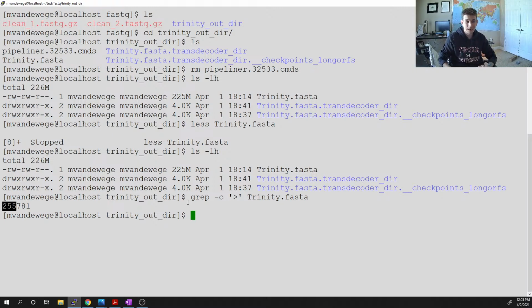Assembly is a good solution using these small reads, but I wouldn't exactly say it's a solved problem. We can use this information and it's way better than nothing, but that doesn't mean it's perfect, because there can be chimeras in here. There can be genes that get merged together as one, as a chimera. There can be assembly artifacts. There can be multiple transcripts for each gene, right? We also have to recognize that alternative splicing is pretty common. So in a good assembly, you'll never see just 10,000 genes and be all said and done.